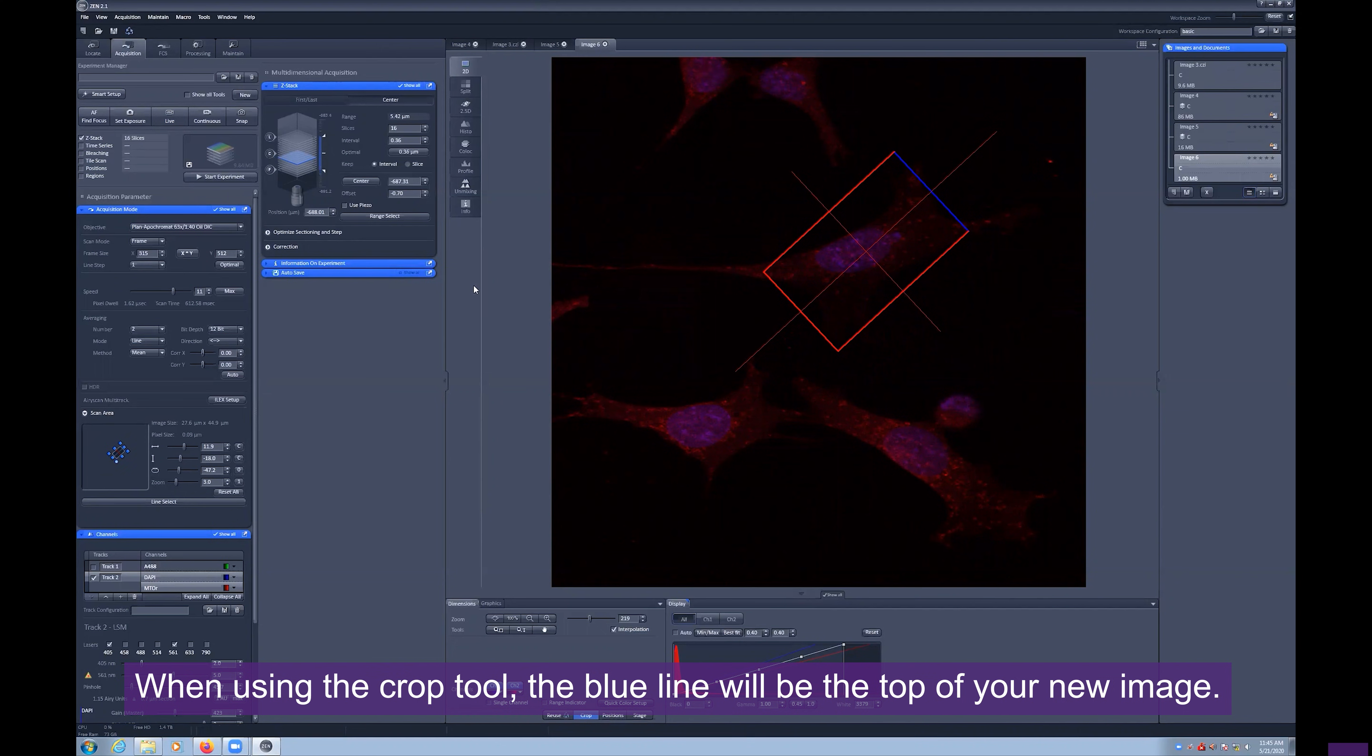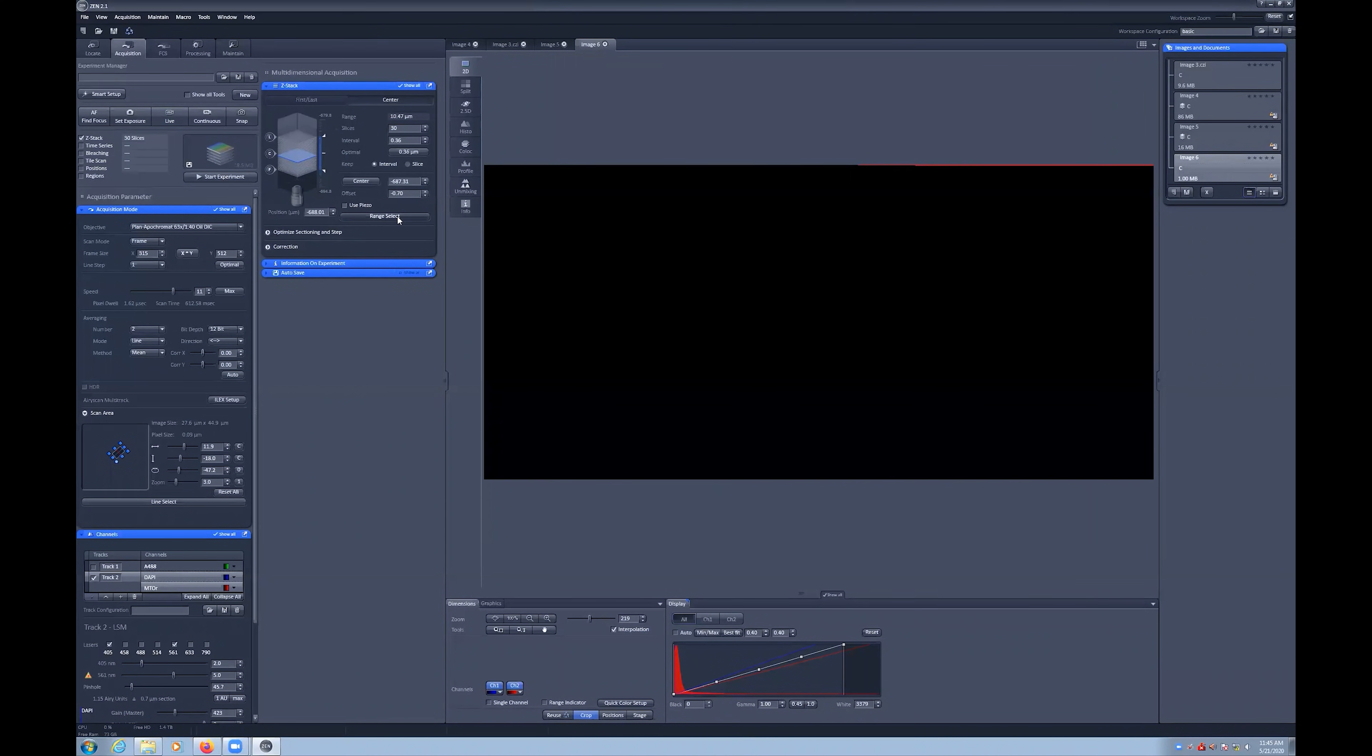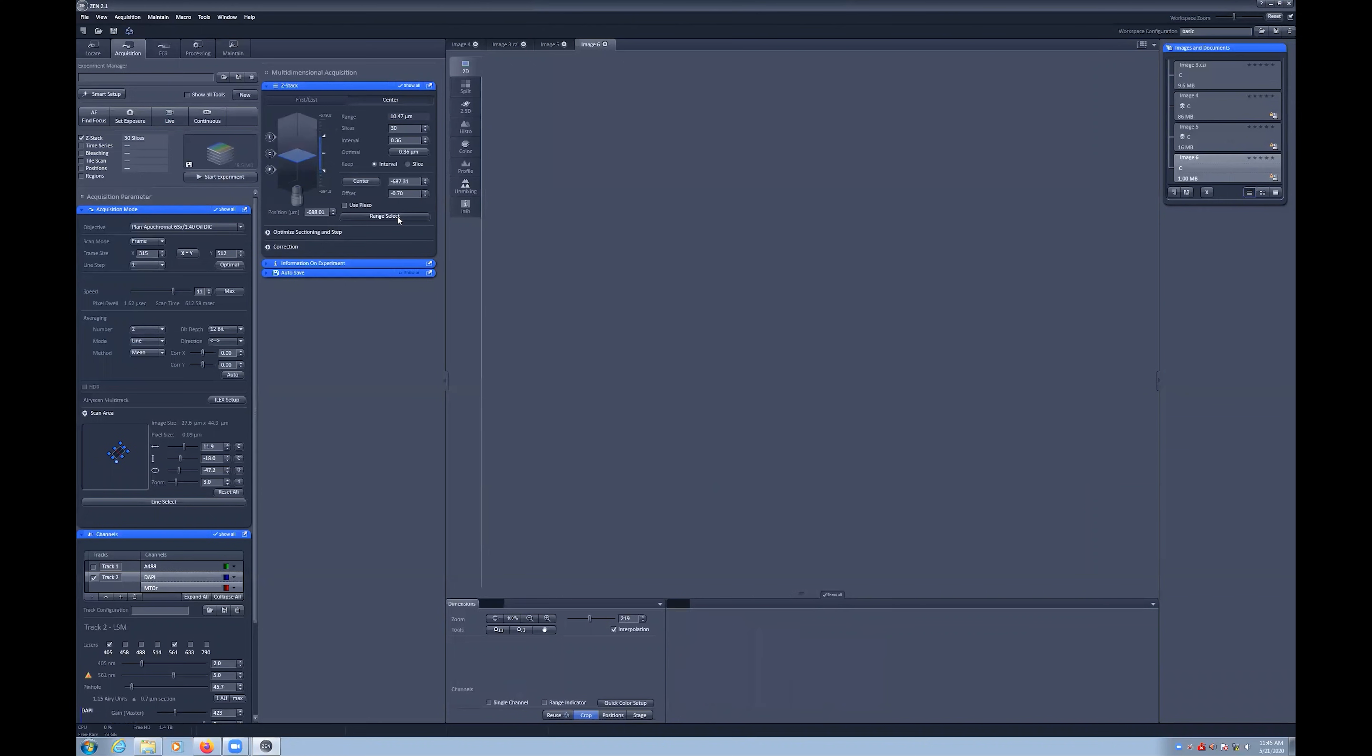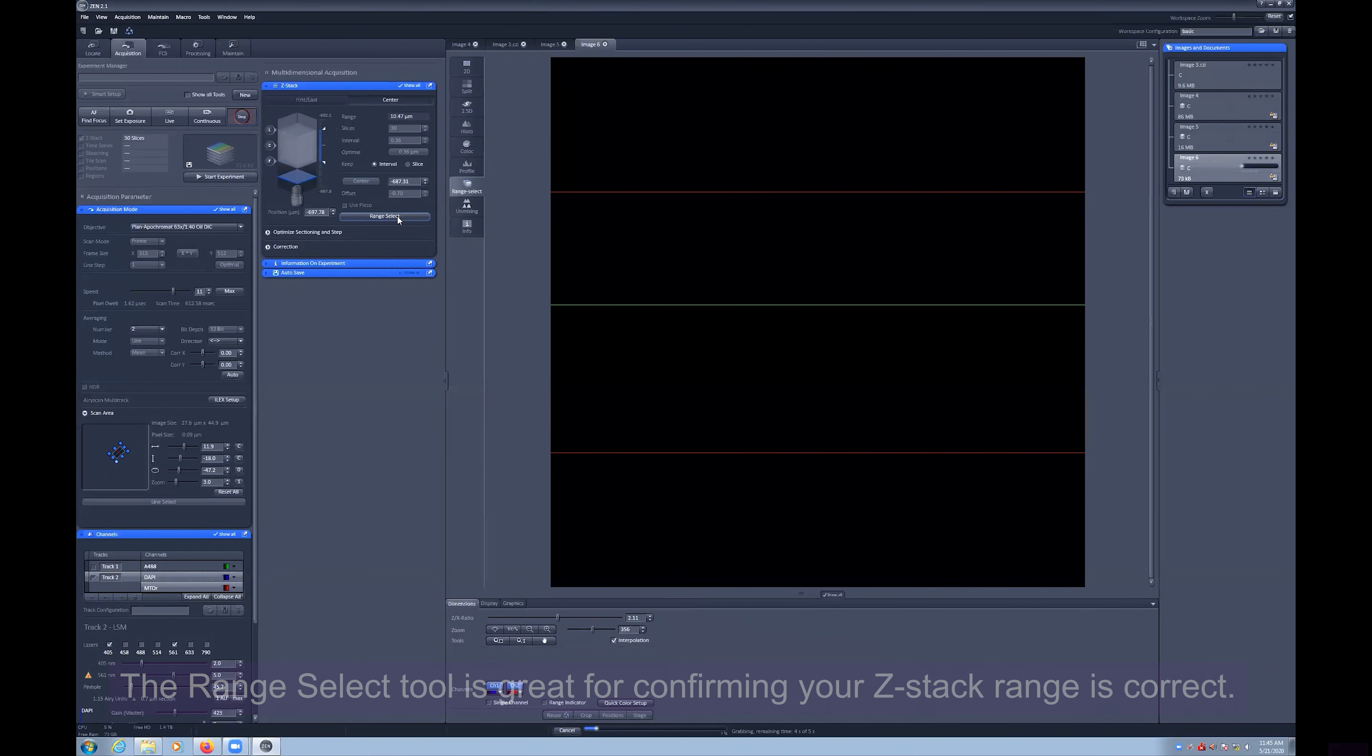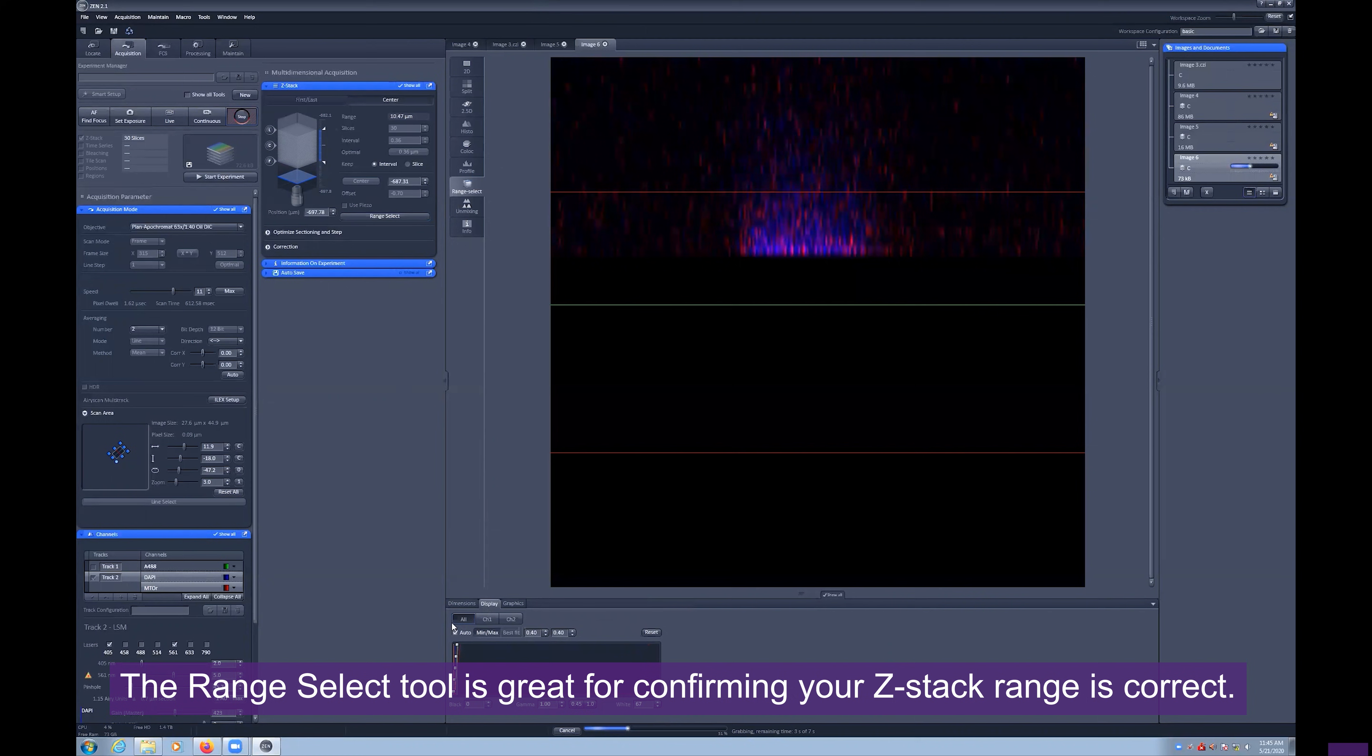We can also increase the slice number to something well above our current number and select the Range Select button. This performs an XZ slice vertically through our sample, quickly showing us the bottom and top of our sample.